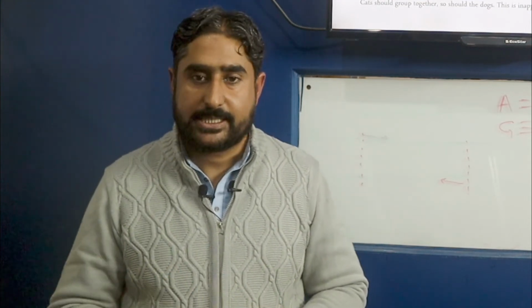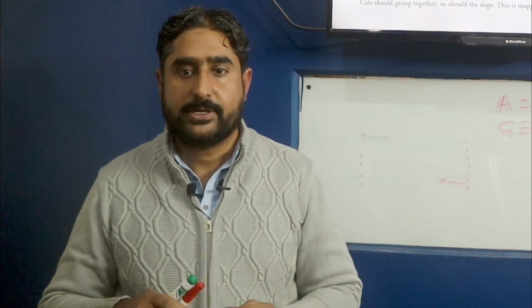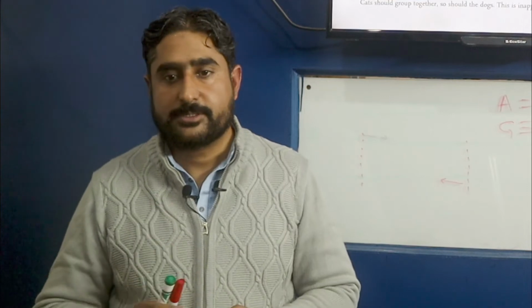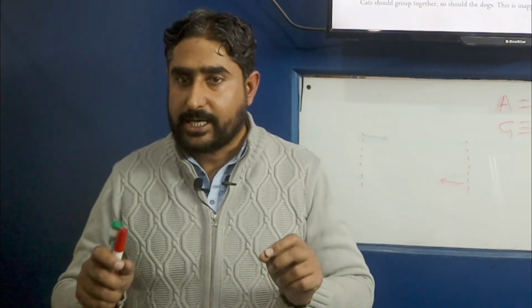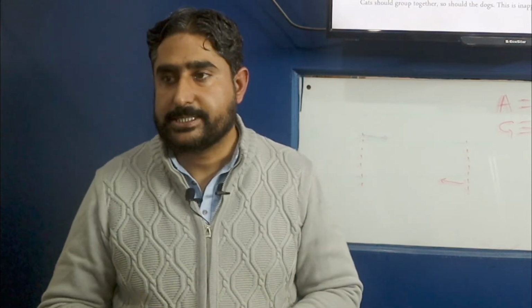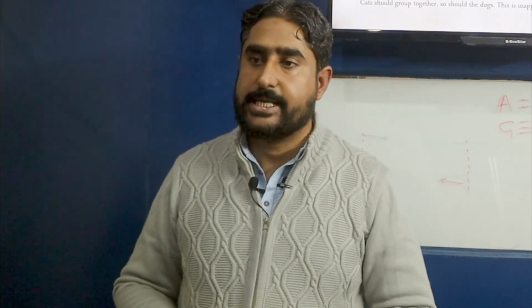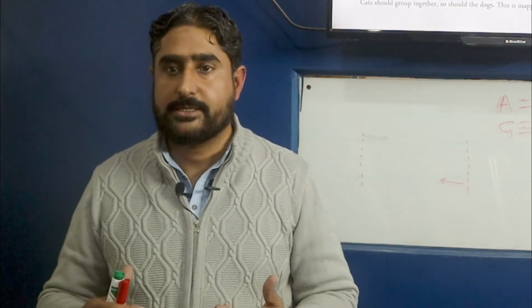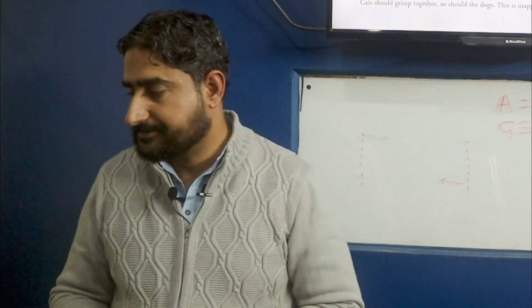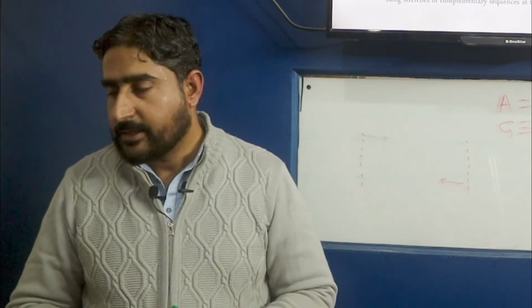But if somebody is interested in population genetics, or investigating different populations or different individuals from one particular species, then he or she will need primers designed for the hotspot regions instead of stable regions. So we need to take appropriate primers depending upon our own study, instead of using any primers reported in the literature. And these primers should be appropriate for the kind of study.